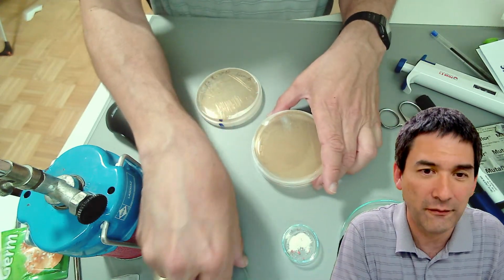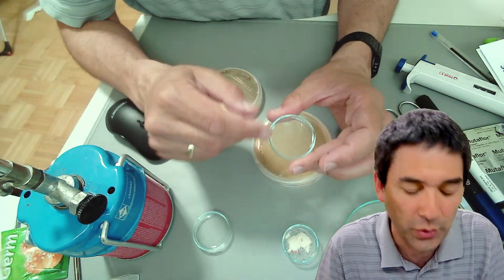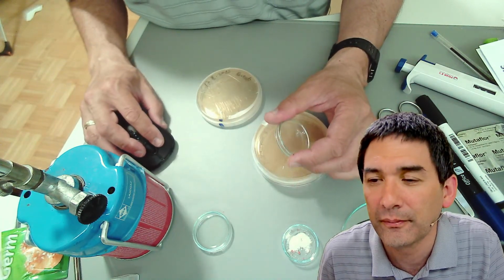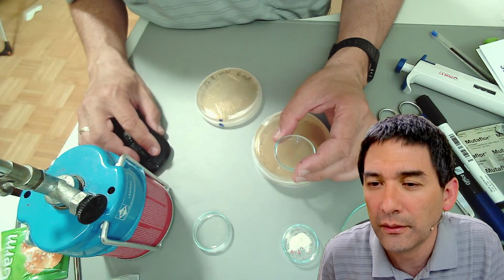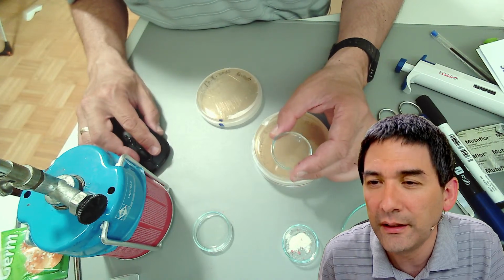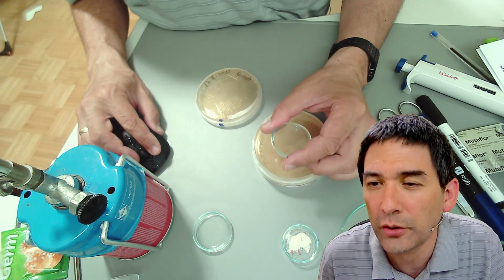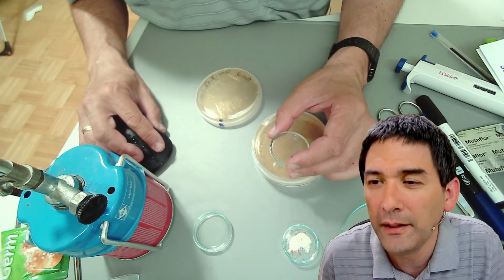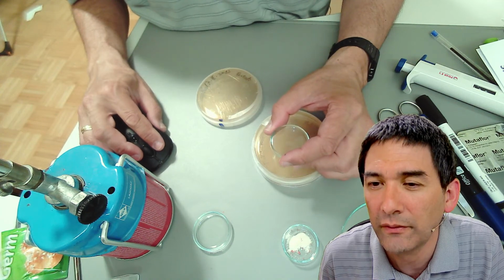Look, I've got also some tiny glass ones here, but I usually use them only for storing water or some other samples, but not for any other things here. Yeah. So let me go down again here. That will be a lot of challenge. I should look inside my kitchen to see if there is a Bunsen burner. Yeah, I mean, yeah. I also need some E. coli pills. Don't know if I can buy them or not.